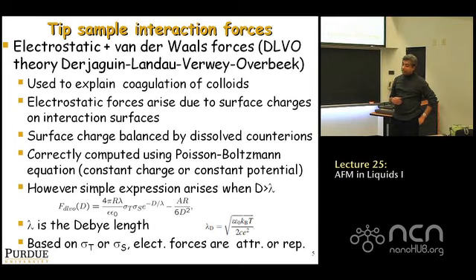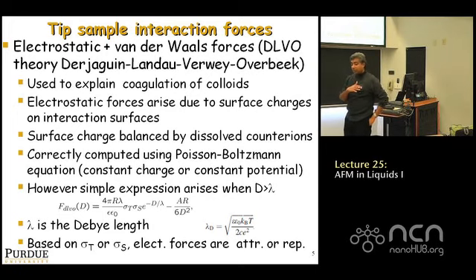So what ends up happening is, either because of the surface potential or charge on the surface, you have a polar medium, and there's an effect called screening of charges that automatically happens in liquids. So you have a positively charged surface, let's say.